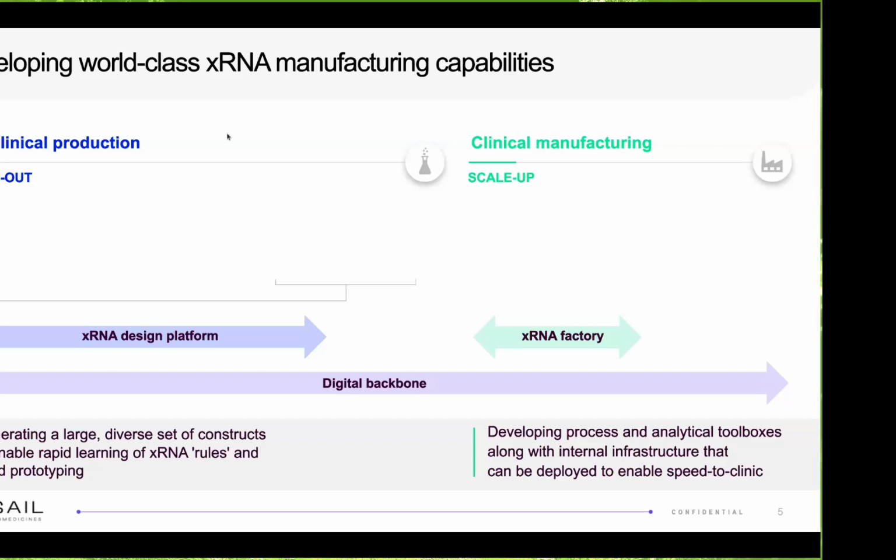So to do this in practice, people will propose genetic sequences, and there are all sorts of ways they come up with these sequences, putting together multiple different building blocks of parts and combining those with ORFs, all to try to get therapeutic results. We take a large number of these trials and test them at a small scale for automation. So it's small scale, but it's a large number, so it's high throughput.